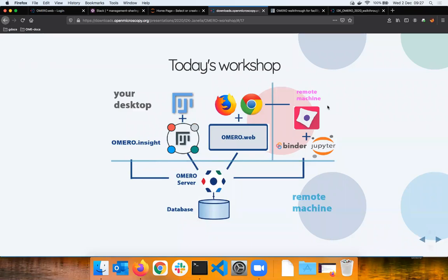Now, that is probably clear. What is here? This is another remote environment which we prepared for you, with the usage of a free service called MyBinder. You can do that as well. You can simply go and do what we tell you later in the workshop and repeat the spin up of a full environment for yourself, where you would have, let's say, Cell Profiler running in that environment, and then easily connect the Cell Profiler to the OMERO server of your choosing, such as this.